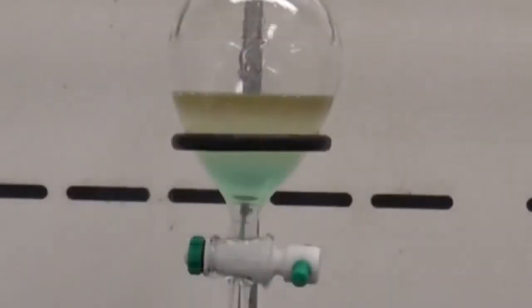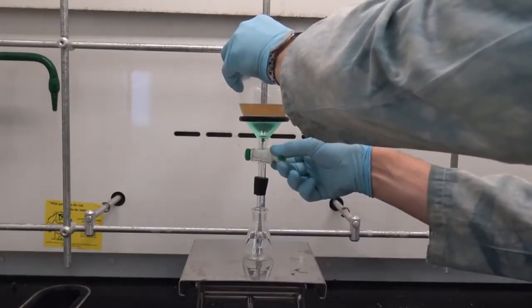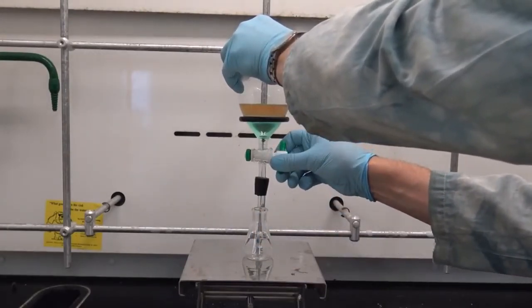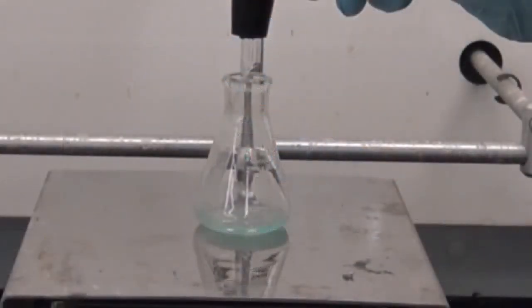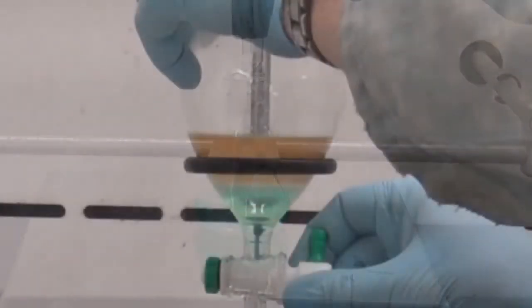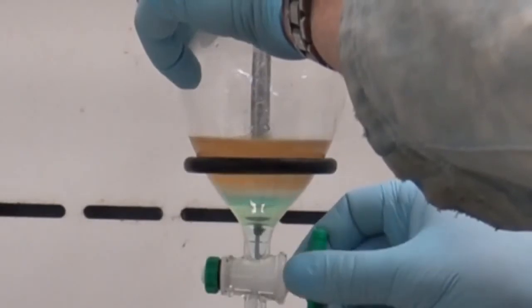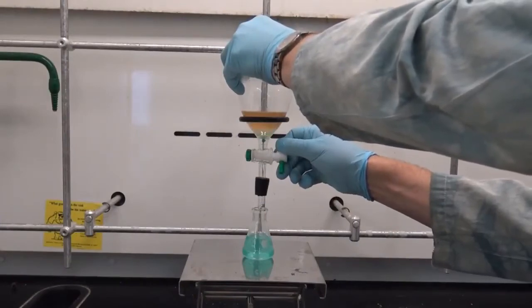After I give it a suitable agitation, I let it rest. And placing a suitable collection vessel below, here I'm using an Erlenmeyer flask, I'll open my stopcock carefully. Notice that the solution that drains out from below, of course, is the more dense water that contains only the blue dye. I'll watch carefully, ensuring that just as that thin layer of emulsion in the middle reaches my stopcock, I close it.